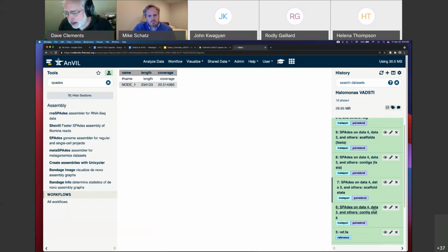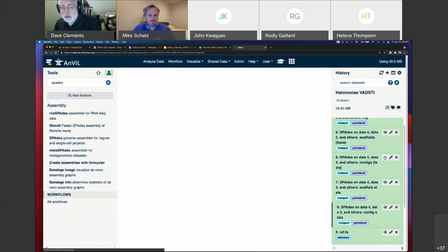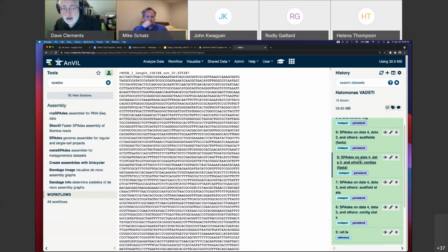Today we're going to use the contigs, these 4 things. One of them is quite long, the others are about half that. Today we're going to use the contigs in our assembly, okay? So before we move on, and let's see, where are our contigs? Our contigs are here. If I poke that in the eye, that's the DNA in each of the 4 contigs.